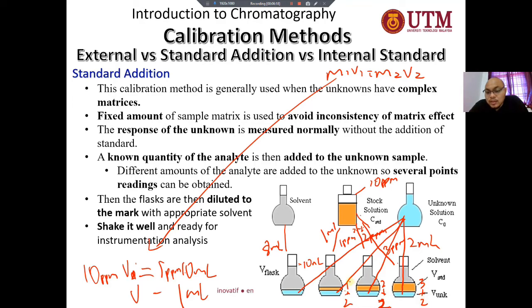1 is for stock solution. 2 is for stock solution. 3 is for stock solution, or 3 ml. 1, 2, 3 ml of stock solution, and 2 ml from the unknown.